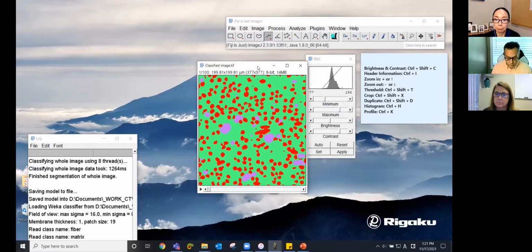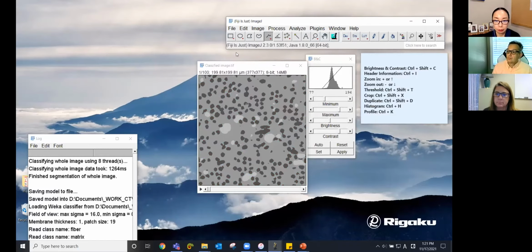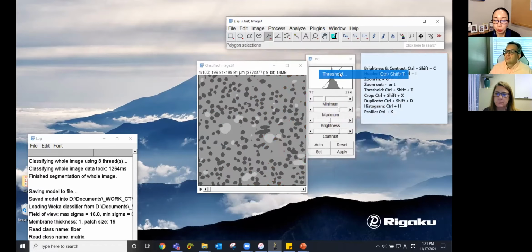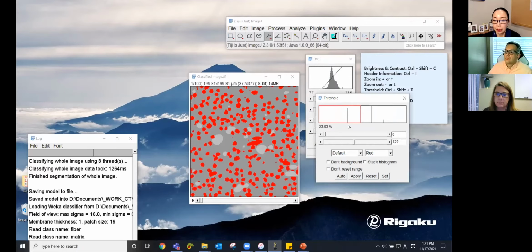Minimize this. To make it easier to treat, I'm gonna switch this back to gray level and go to thresholding. And the reason why this is easy to threshold is that now you have only 3 values in histogram because it's been already segmented.